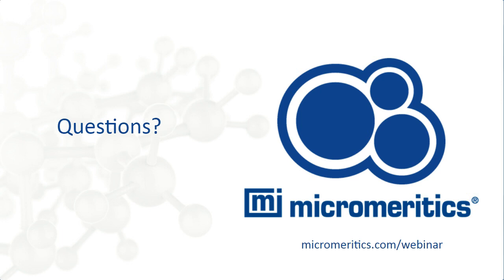Absolutely. Thank you, Nikki. So our next question, probably going to be coming to you, Jeff. How can Micromeritics products be used in the recycling of lithium-ion batteries? I know this has been a lot in the news lately. So can you touch on that?